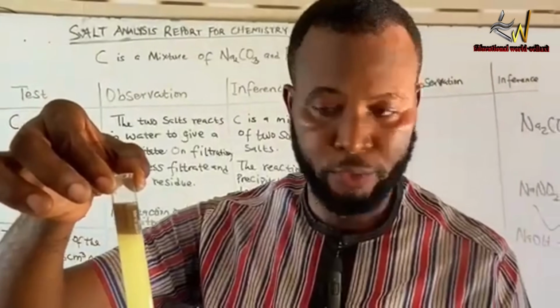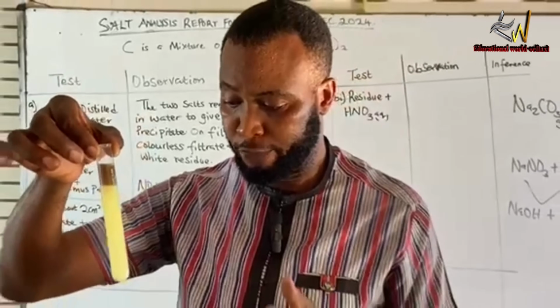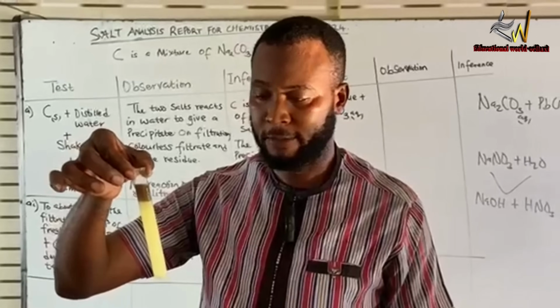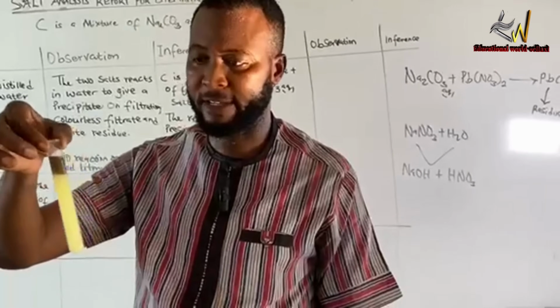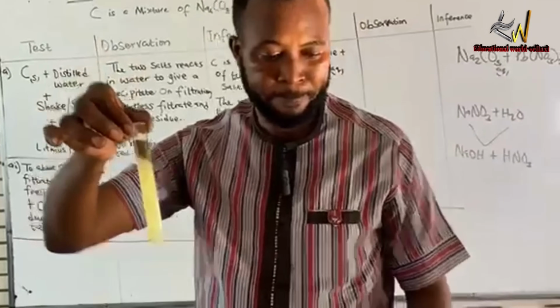Now when you get new iron 2 sulfate and you prepare a solution, don't waste time, it will give you a brown ring test, but this is my brown ring test, okay? All right, thank you.